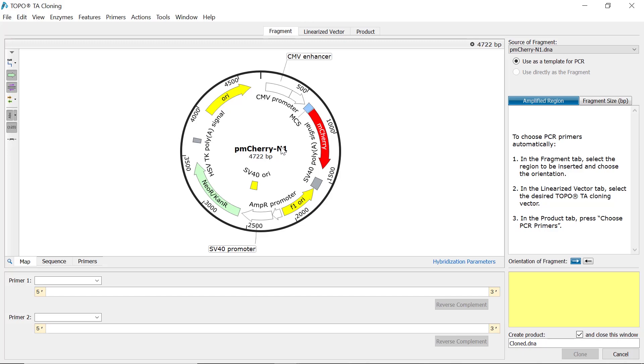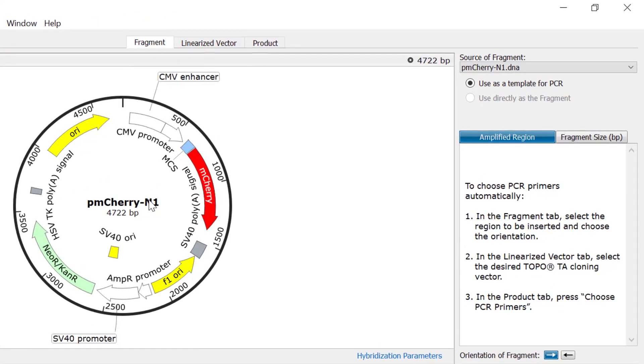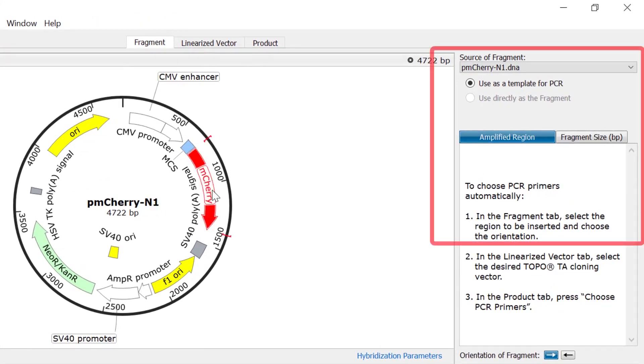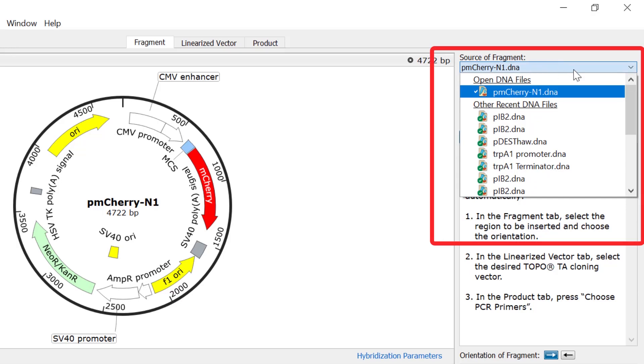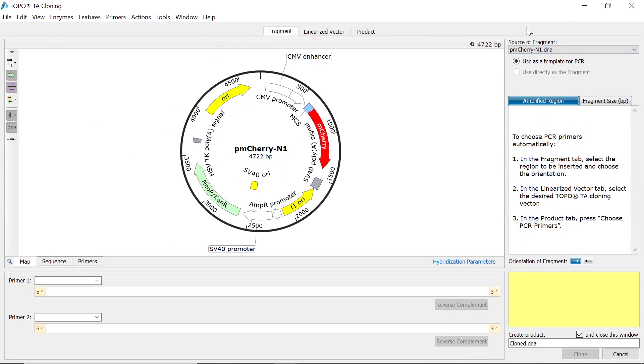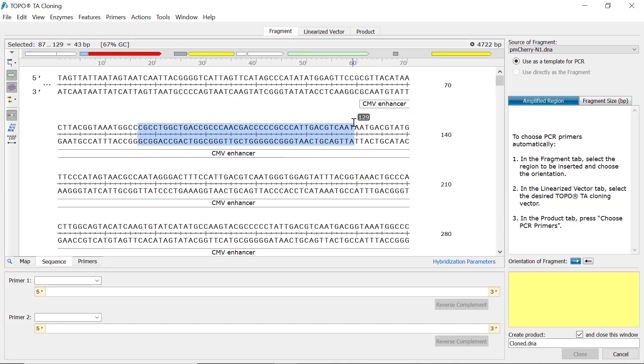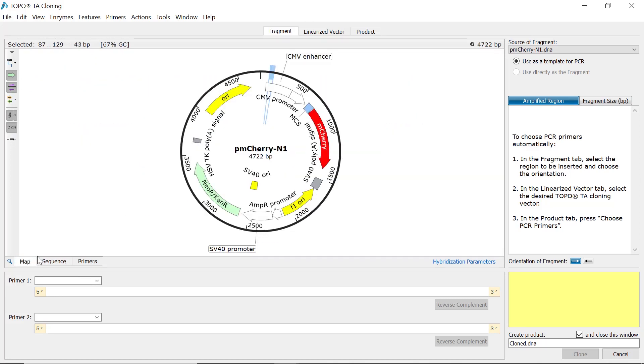However, if you prefer to use a different file to specify the fragment, you can use the drop-down menu to either open a recently viewed file or another file on your computer. Next, select the desired region for insertion. To do this, either switch to the sequence view and highlight a region of interest, or go back to the map view and select a feature.